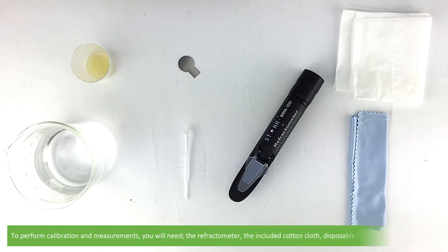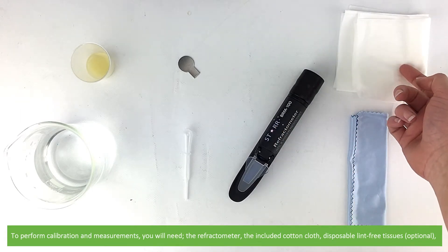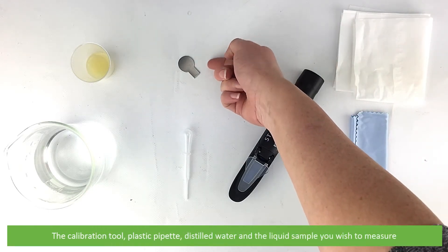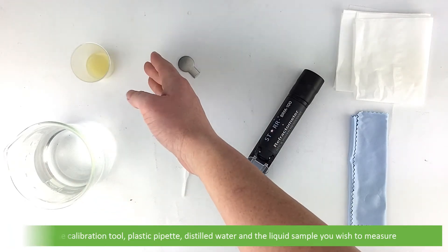To perform calibration and measurements you will need the refractometer, the included cotton cloth, disposable lint-free tissues (optional), the calibration tool, plastic pipette, distilled water, and the liquid sample that you wish to measure.